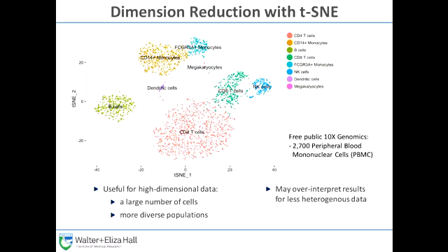So again, in this one plot, we get a big overview of the data set. And if you're analysing a single-cell RNA-seq data set and you're collaborating with biologists and you give them a picture like this, they'll generally ooh and ah, and they'll be very pleased and think you're super smart and doing a great job. So that's handy.